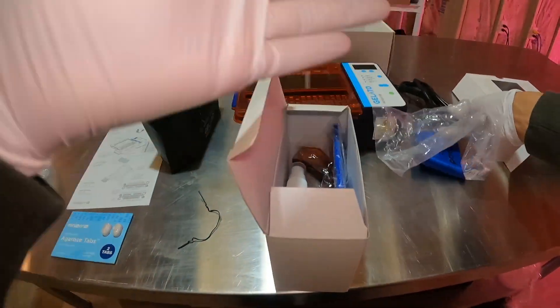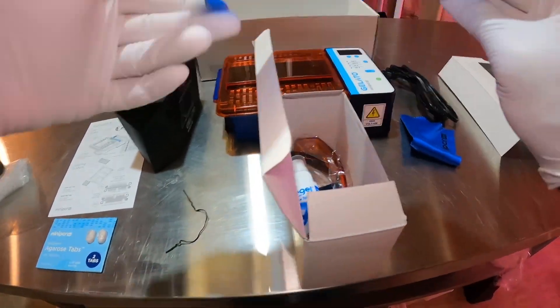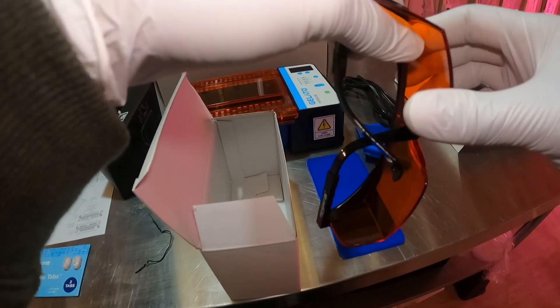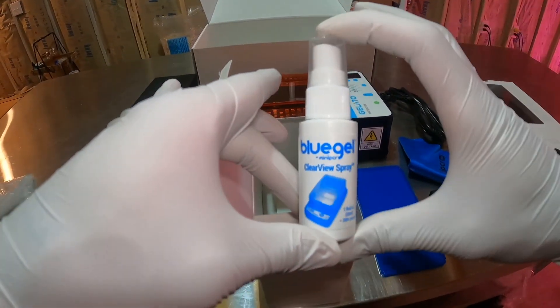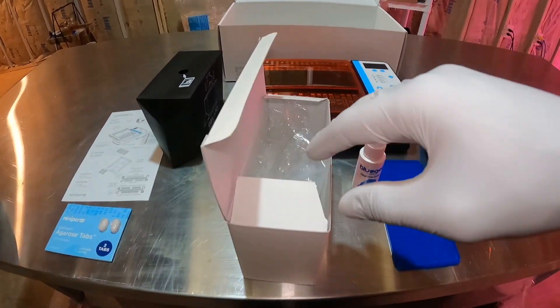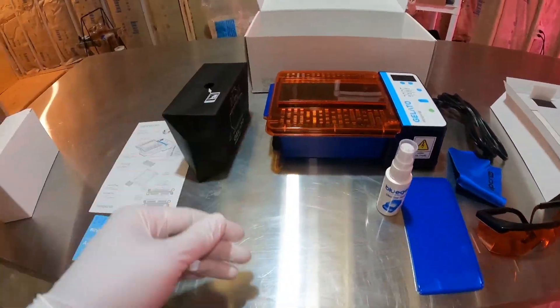We have our power supply here — this is the United States standard power supply. And then we have the gel cutting tray, so you can take your gel out and cut your bands of DNA out. You're going to want to use these glasses whenever you're using the gel cutting tray since you don't have the orange lid on top. And then there's some spray to clean off the visualizer orange lid.